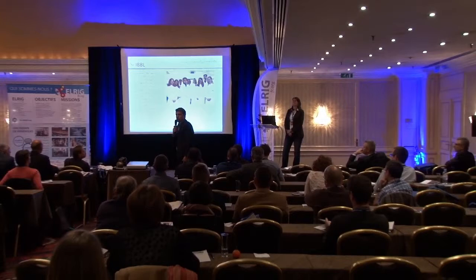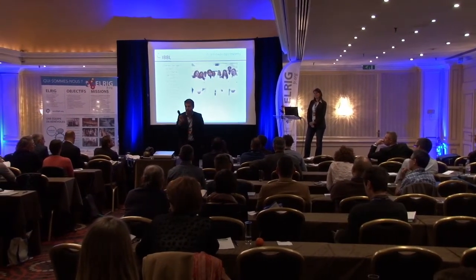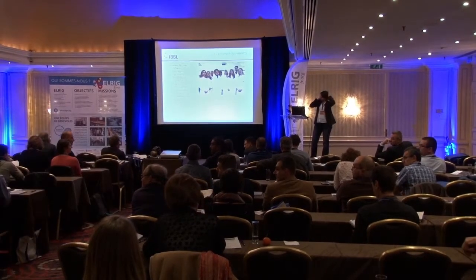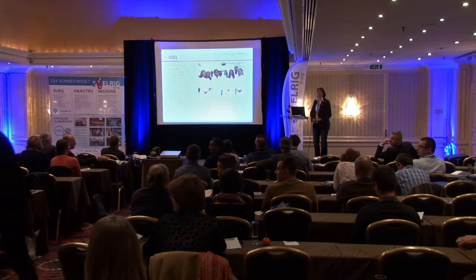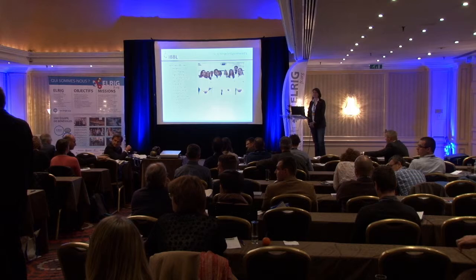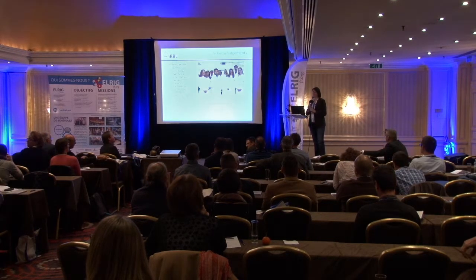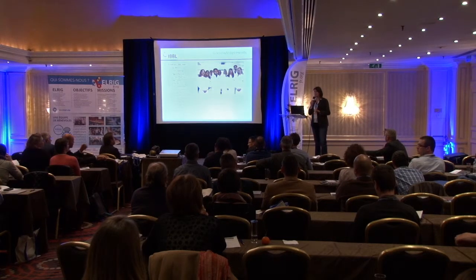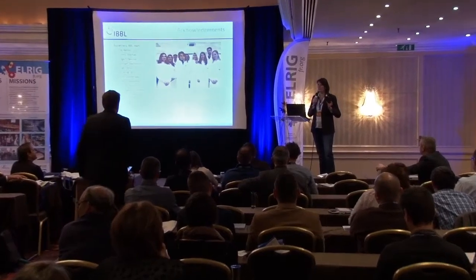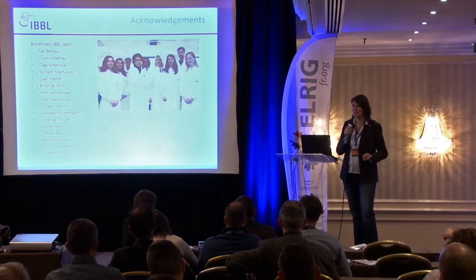So, any question for Conny? I was just wondering, when you do your DNA extractions, do you store that DNA in multiple tubes or just in a single tube? We store it for the moment in one single tube, because we wanted to have the best efficiency of storage capacities.